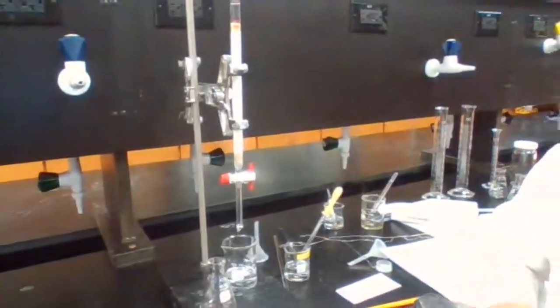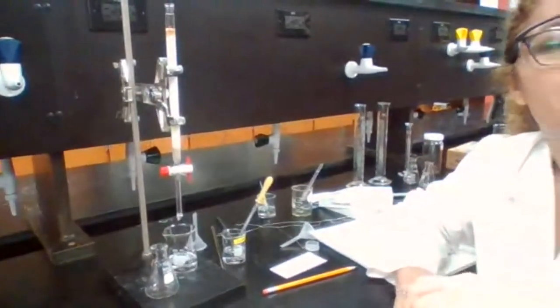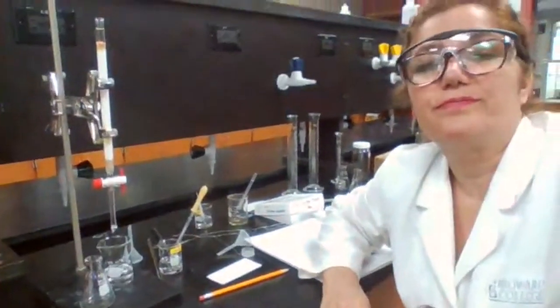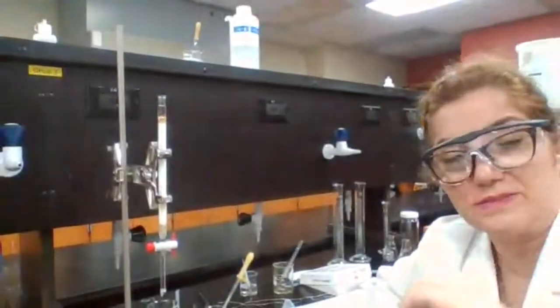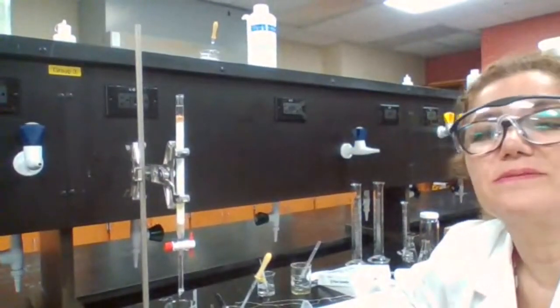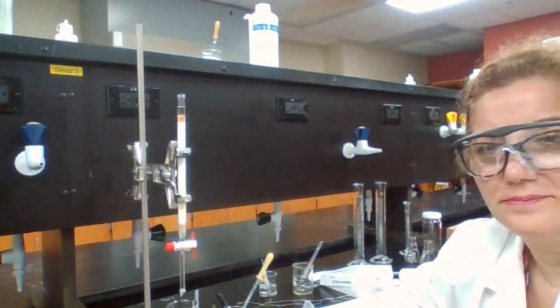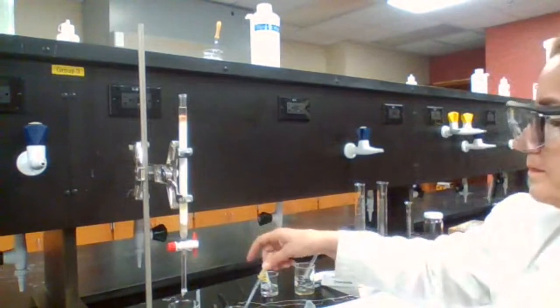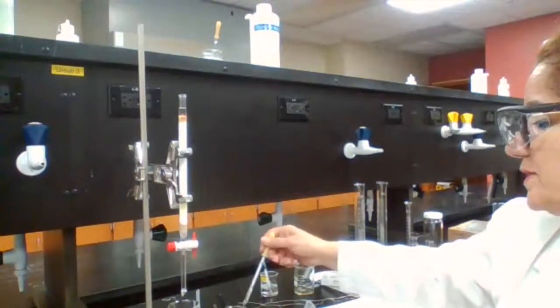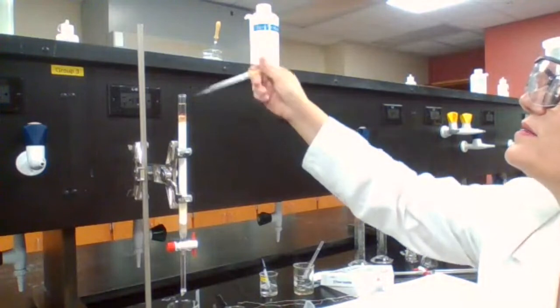Okay, no question. It could be very good news. Right? It could be good news that you don't have questions. That means the experiment is clear. You read the procedure and you have no questions. You just have to be careful with this top of the column.